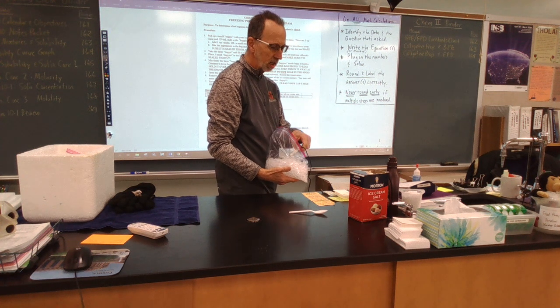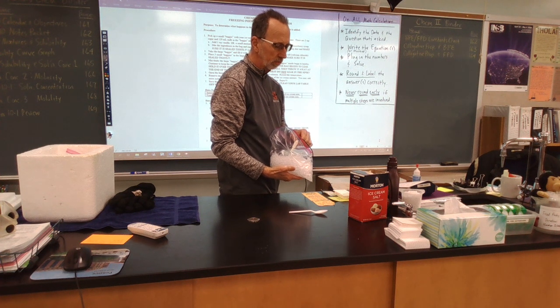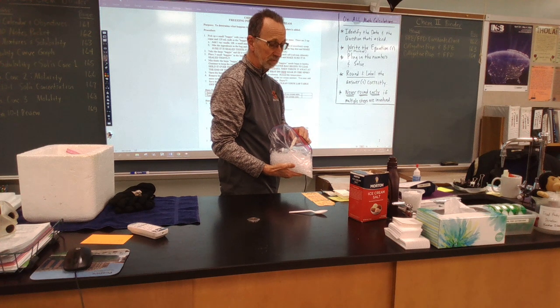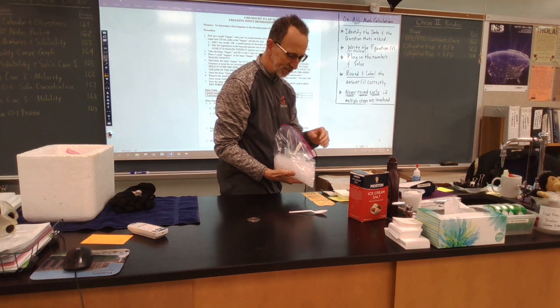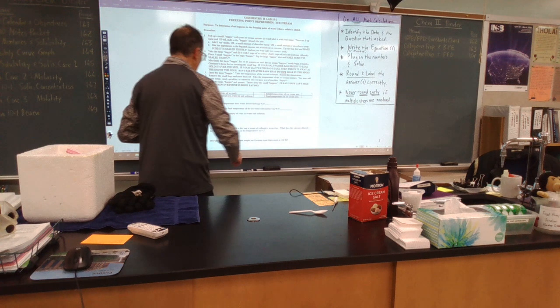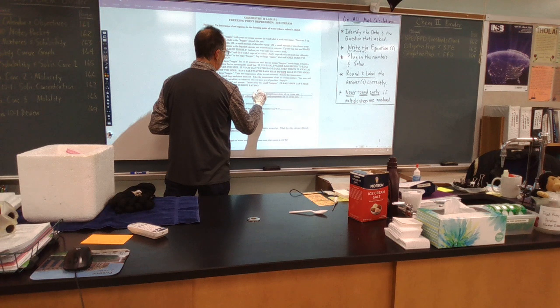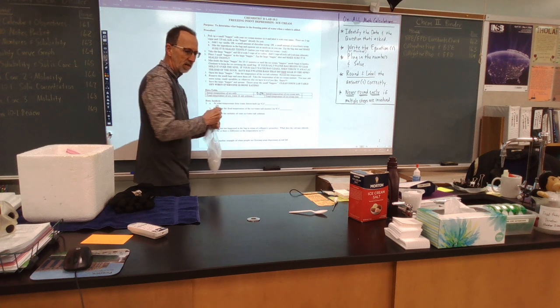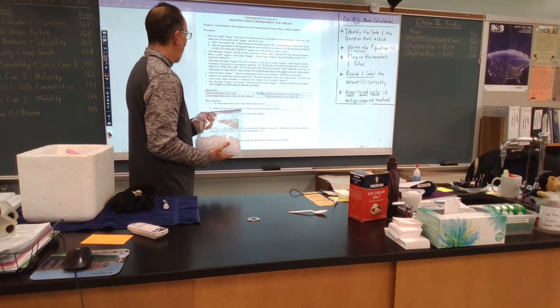So I have it in there. And lo and behold, there she goes down. We're right at 0, actually. It's fluttering between negative 0.1 and 0. So close enough. All right. So that I would record right here. The initial temperature of the ice only is 0.0 degrees Celsius, since our electronic digital thermometers go out 1 decimal place.